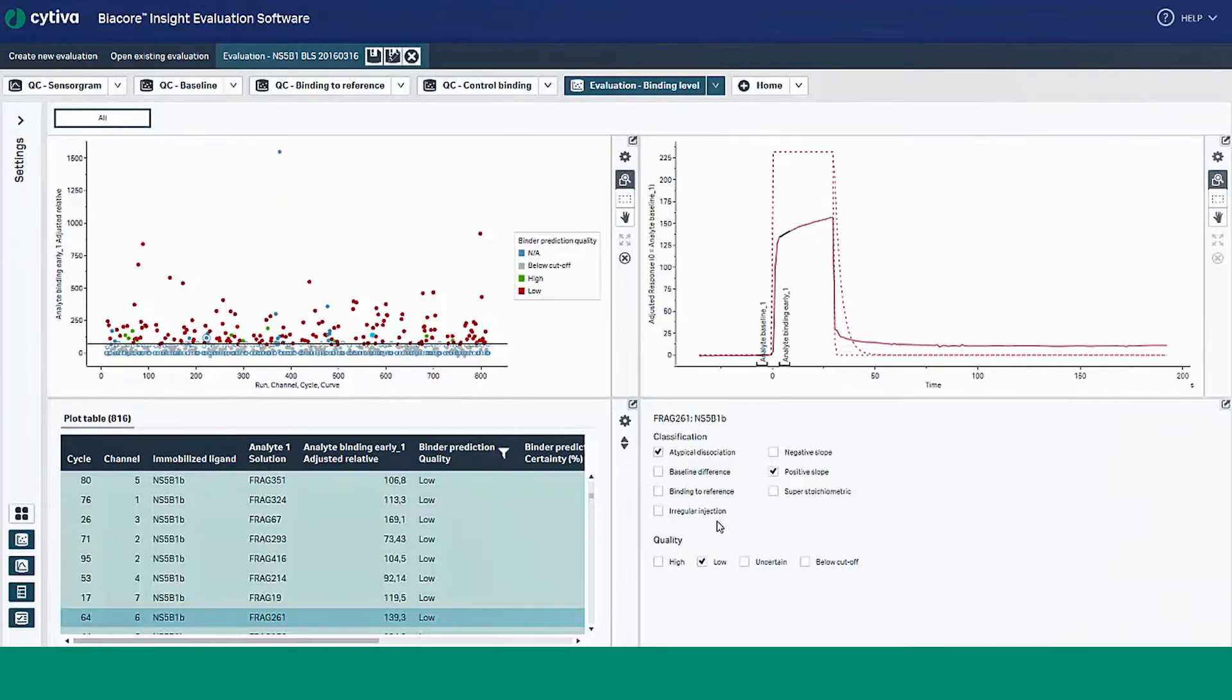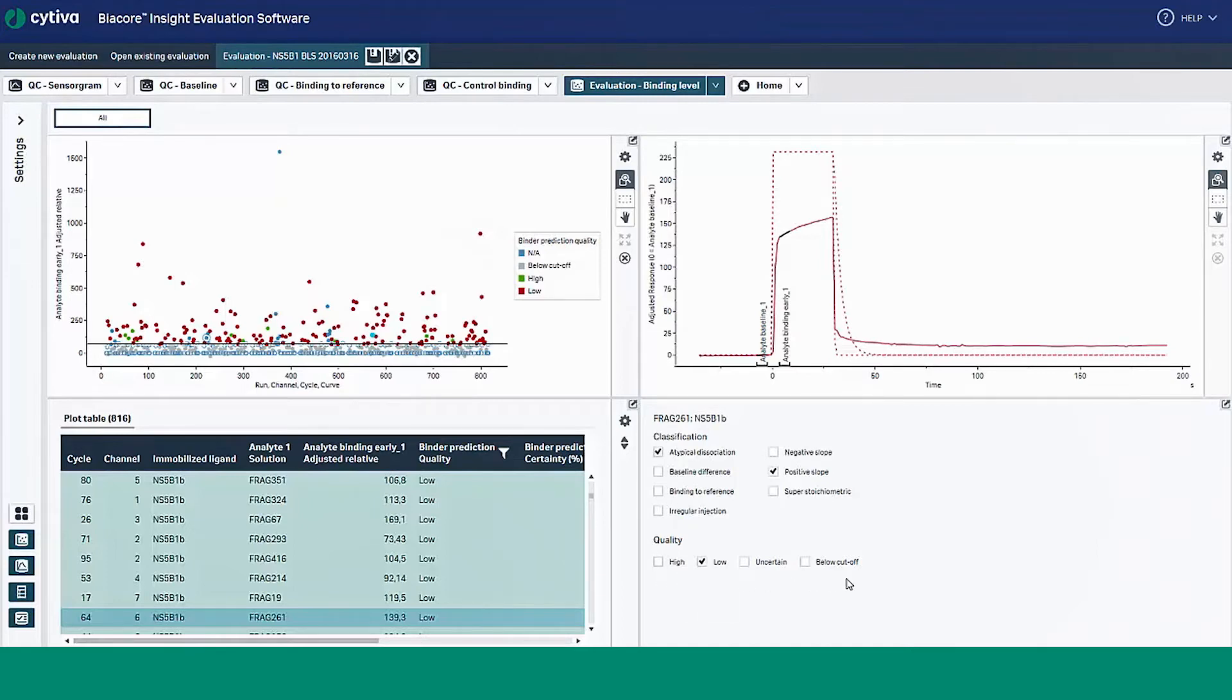Quality automatically predicts the quality of the interaction, either high, low, or uncertain. We provide definitions for the binder prediction classifications in the Biocore Insight Evaluation Software user's manual.